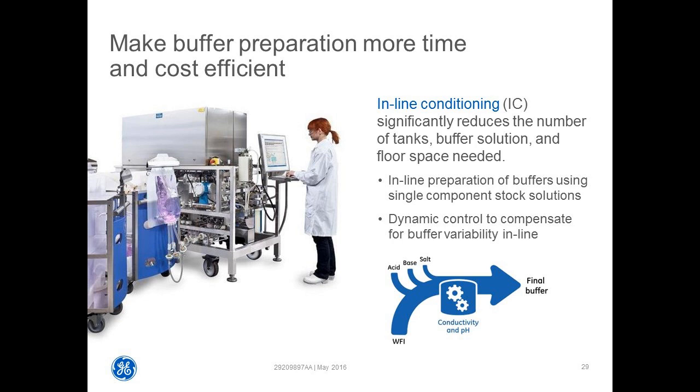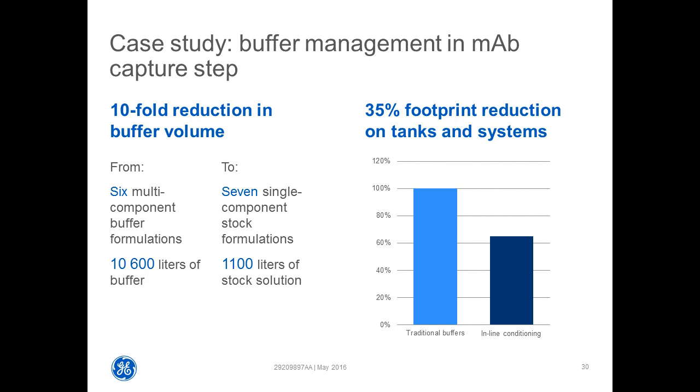So how does this work in practice? Here is a case study where inline conditioning was implemented successfully, leading to a 10-fold reduction in buffer volume and almost a third reduction in the footprint of tanks and systems that were previously used to prepare buffers manually.